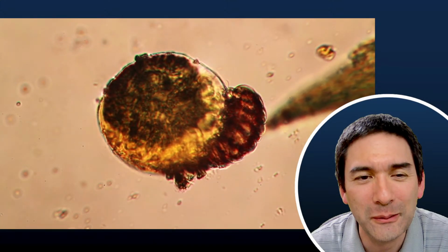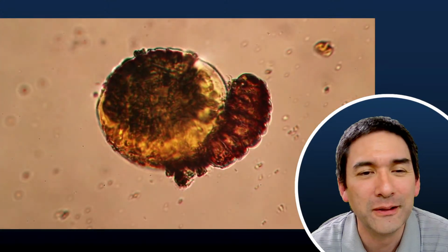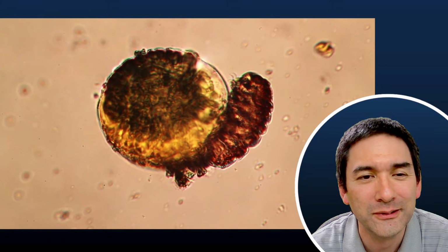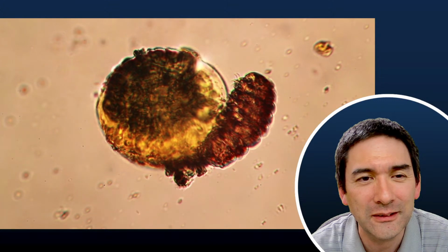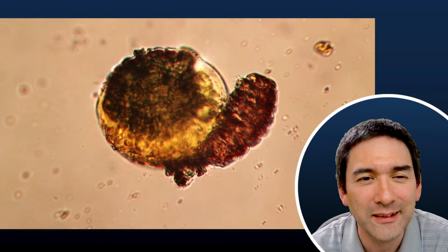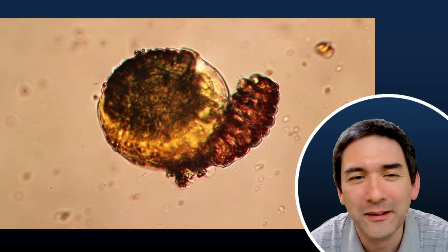And then you have to wait a little bit, a couple of minutes. And as a matter of fact, it came back to life. Now look, it's slowly starting to move. Slowly starting to move. And the legs are also slowly extending. And then after a couple of minutes, it's back to normal again.